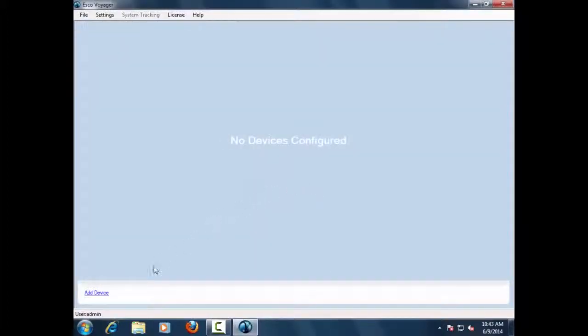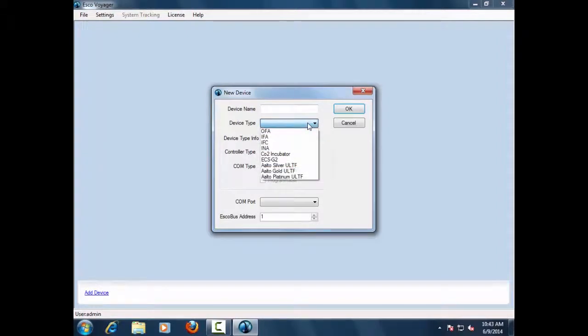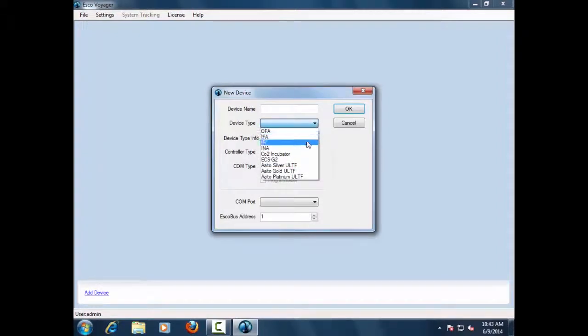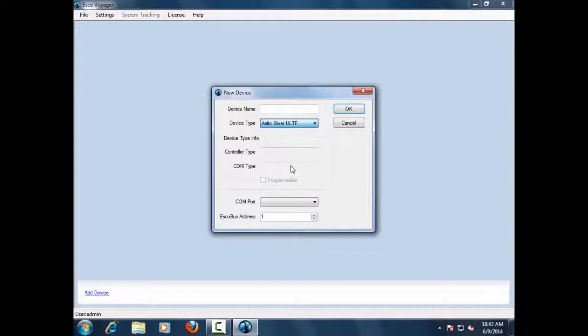Users have options to add multiple devices on the Voyager software system, such as ovens, incubators, refrigerated incubators, CO2 incubators, and ultra-low temperature freezers with different controller types.